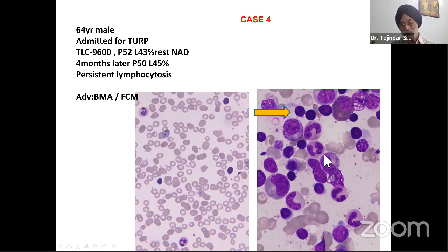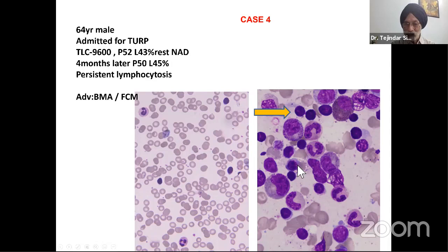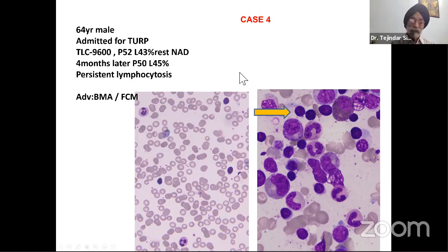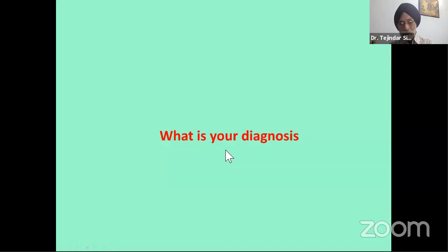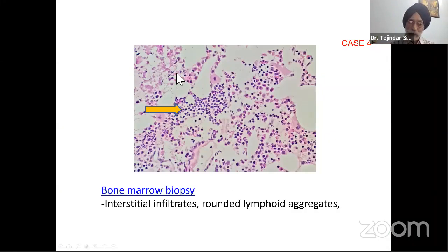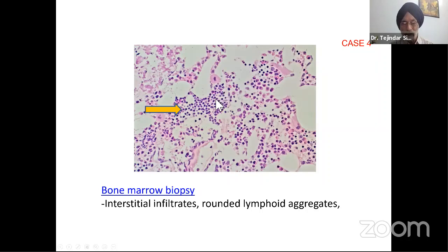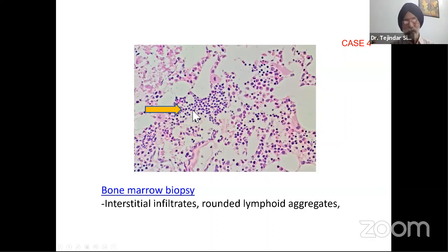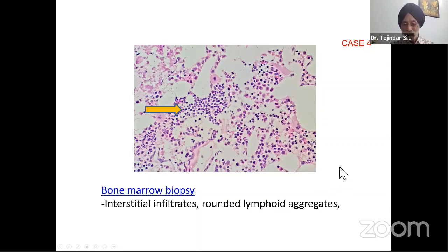On bone marrow aspirate, myelopoiesis was normal, erythroid precursors were present with normoblastic reaction, and dark-staining lymphocytes were increased in the bone marrow. The bone marrow trephine biopsy was largely normal — a 2-centimeter long biopsy was normal overall. There were only three small foci of lymphoid infiltration with mature lymphocytes — not enough to label as a lymphoid nodule or follicle, but there was an interstitial tiny infiltrate. So interstitial infiltrate and rounded lymphoid aggregates were seen.